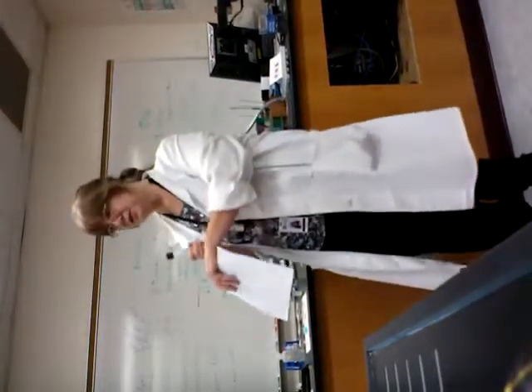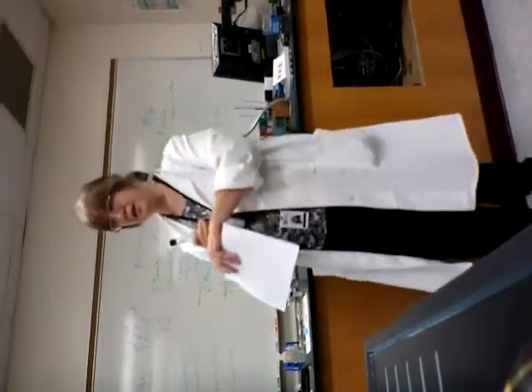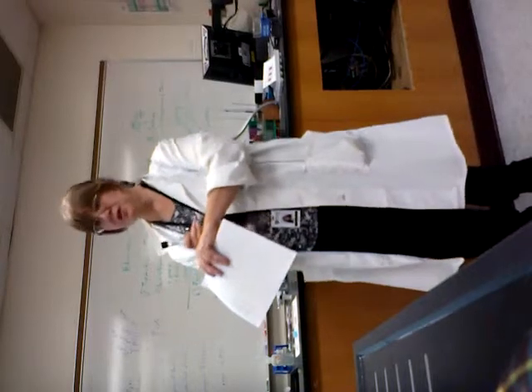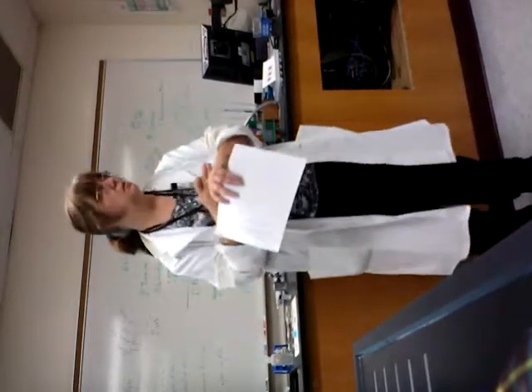If you have a skin sample handed to you, and you find acid-fast organisms, also called the what technique? Ziehl-Neelsen. Ziehl-Neelsen technique. You see those hot pink organisms and you've done the staining technique. What is your disease? Lesion on the skin. Leprosy. Okay, what if it comes from the lungs or sputum? Tuberculosis. Sometimes you want to check out your source. Okay? For tests, we're going to go to the biochemical tests.